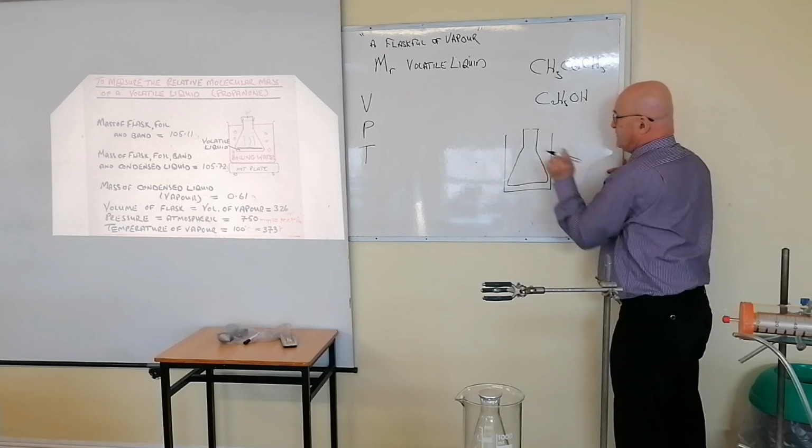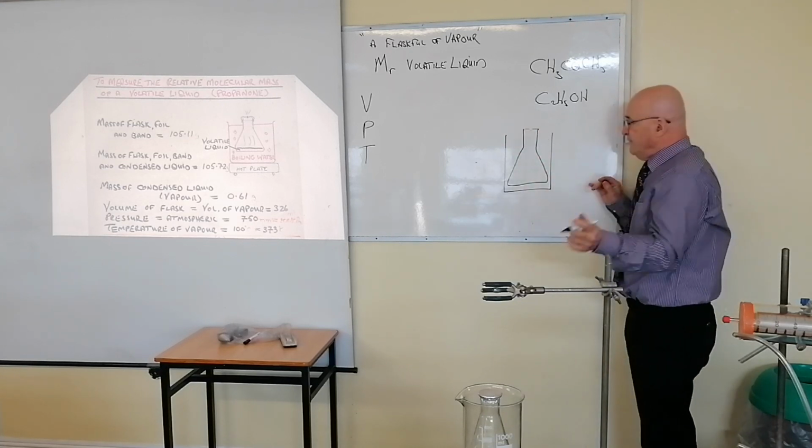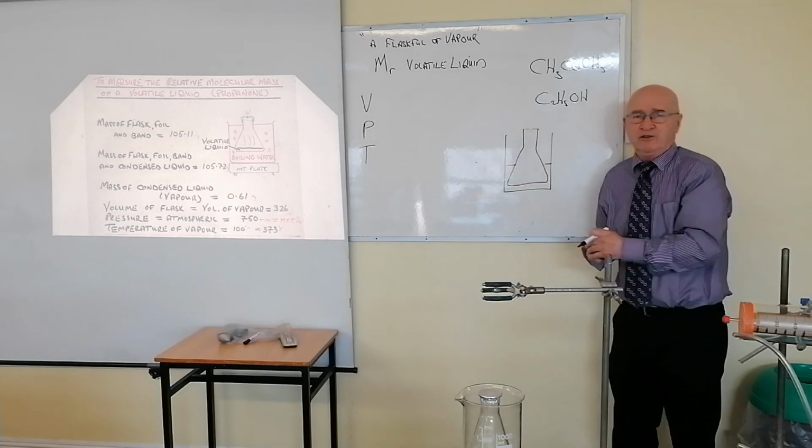Right, that's what you have. Don't forget your pinhole there, okay? Very important. Now, these are the kind of errors now. People put the water in there. That's lovely, okay? Except you've lost marks straight away because not all the vapor is at 100 degrees.